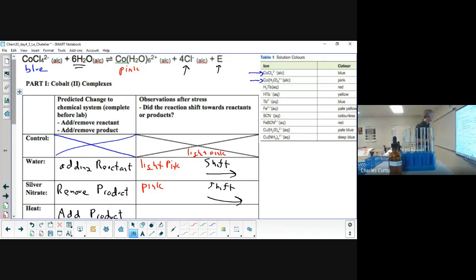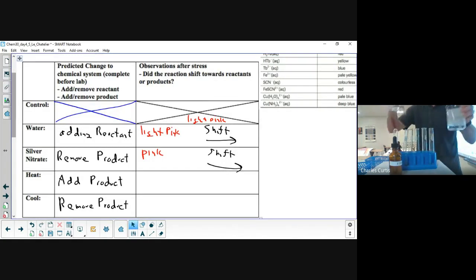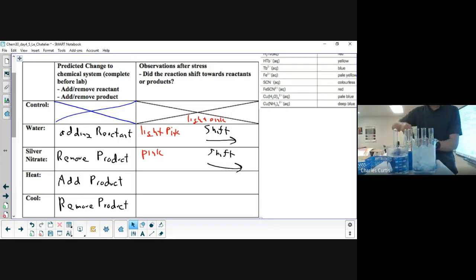So doing a little bit of analysis, if we added a reactant, it went away from it towards the products. If we took a product away, it went back towards the products. Okay. Next, we're going to heat and cool. Now, I find this the most interesting part, and I can really convey the notion of equilibrium. I'm going to grab my thinnest test tube. So next is heating, and this would be adding a product.